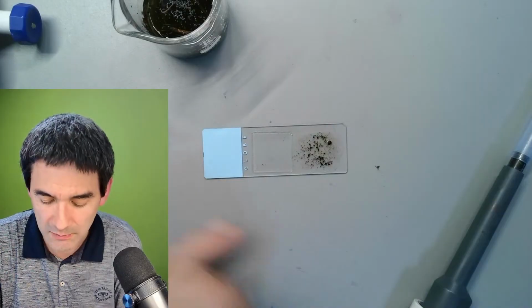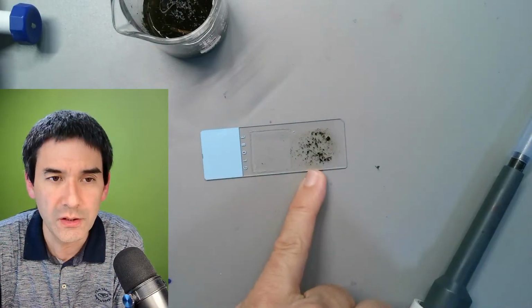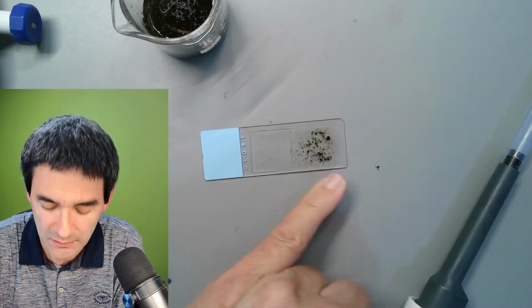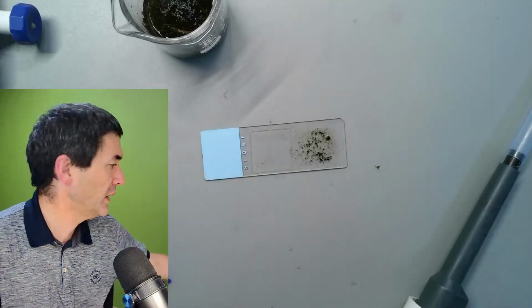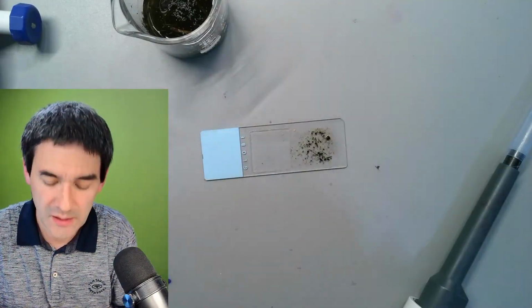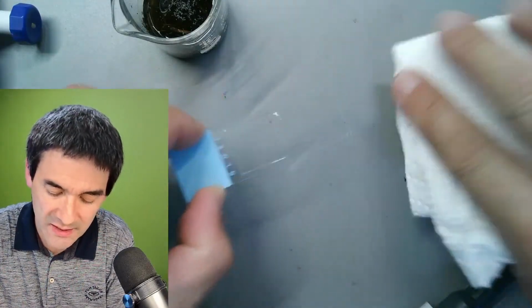Then whatever is in here, and the rest over here, because there's always the danger that you're going to get your objective wet, what I usually do is simply take some tissue paper to remove any excess.